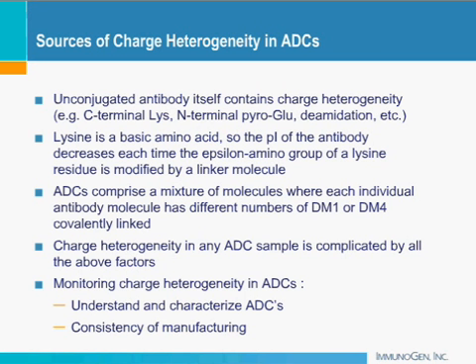And when we look at the PI of the main peak of the antibody and the PI of the rightmost peak on the ADC profile, they correspond very well. And we have verified by various spiking studies that the first peak, the rightmost peak in the ADC profile, actually is the unconjugated antibody. So it is very useful, ICIEF, in monitoring the charge heterogeneity of antibody and antibody-drug conjugate samples.